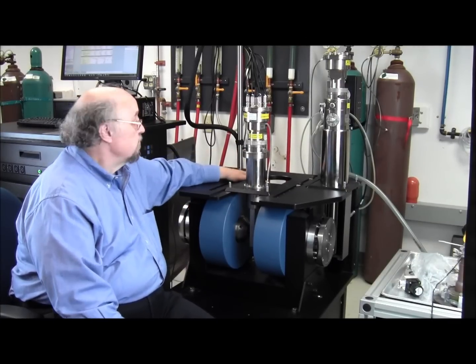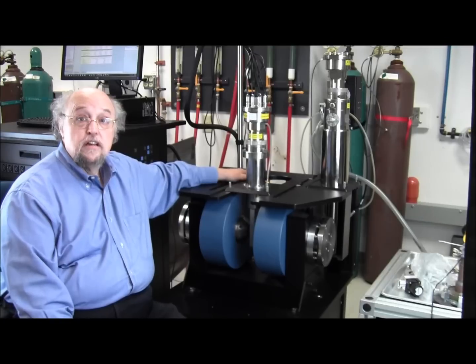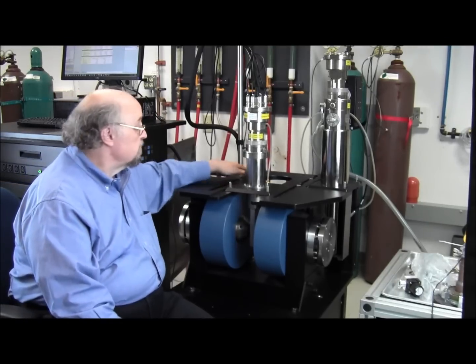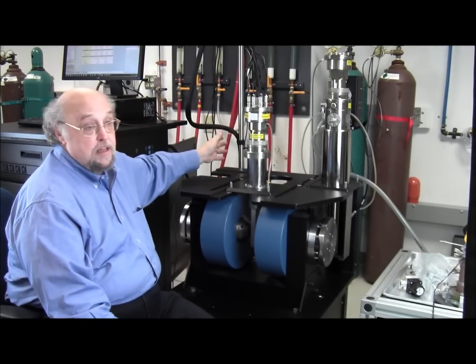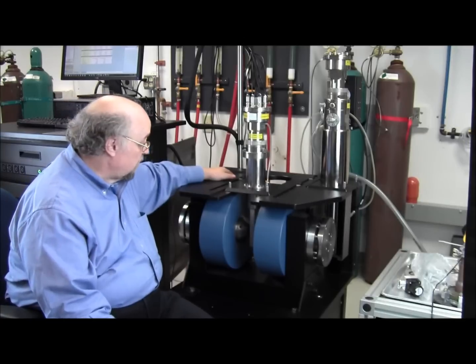Behind the sample module here is where you would store a closed-cycle refrigerator. If you had that option, it would sit here. But over here might be the liquid nitrogen dewar for liquid nitrogen measurements.